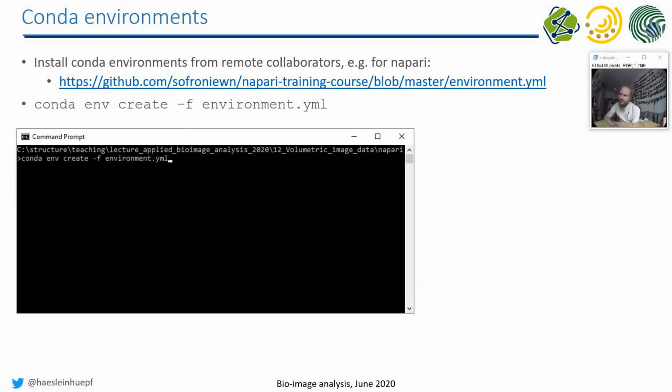So one thing I learned, and some people asked in one of the Zoom seminars, I learned it while using Napari. So far we were creating Conda environments by creating a new environment and then installing software into this. And I told you that you can exchange Conda environments with other people so that they have the same software installed as you. And for example, if they want to allow us to try out Napari on our computer, they want to provide an environment where Napari is installed. And these are the so-called environment YML files you find in some example repositories of example code for Napari.